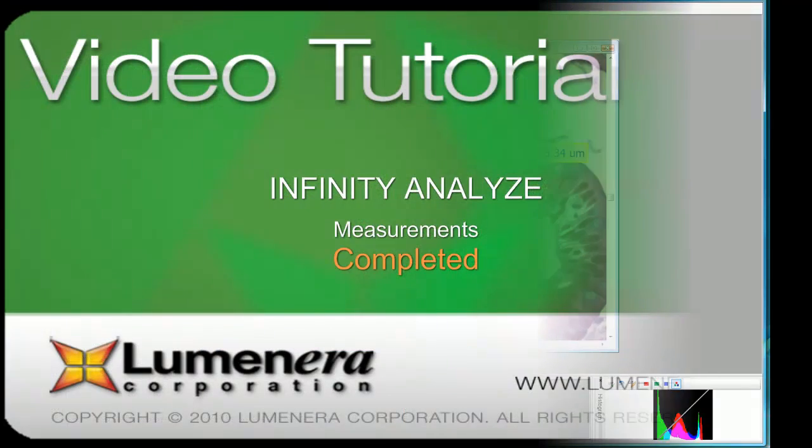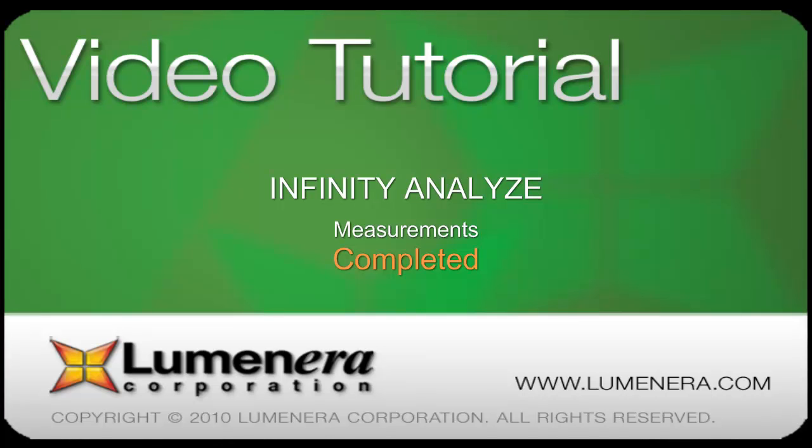That brings us to the conclusion of the Infinity Analyze tutorial on measurements. Be sure to investigate the other tutorials that we have in this series that feature other aspects of Infinity Analyze.